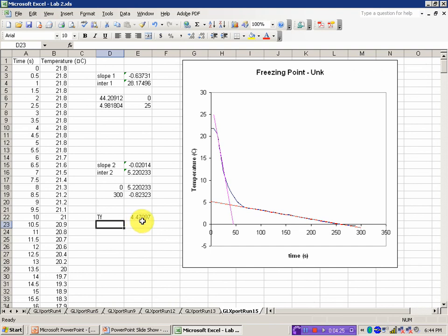And that calculates my freezing point as 4.470. Without doing a full regression analysis, it's difficult to determine the number of sig figs we should have, but I would think that we wouldn't want more than 3 significant figures for certain, and probably only 2. And that's the freezing point that we would use in calculating our temperature change, or our freezing point depression.